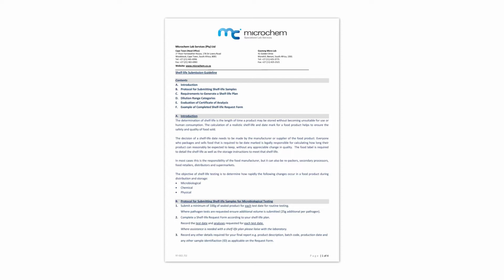distributors, and supermarkets. The objective of shelf life testing is to determine how rapidly the following changes occur in the food product during distribution and storage. These factors include chemical, microbiological, and physical.